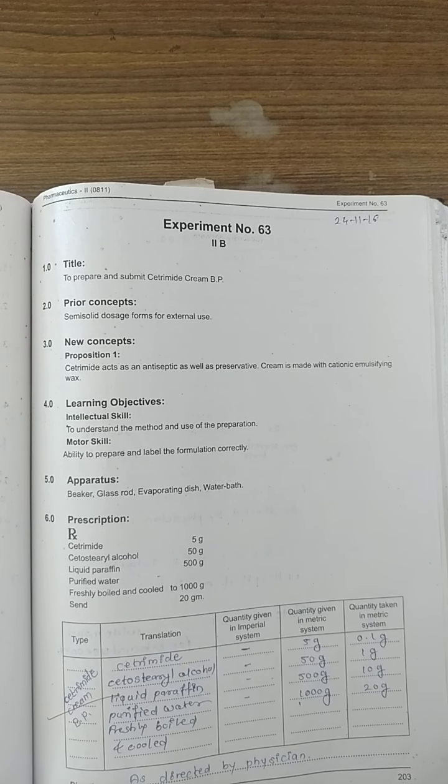We have to make cetrimide cream as per the given prescription. The ingredients are: cetrimide 5 grams, cetostearyl alcohol 50 grams, liquid paraffin 500 grams, and purified water freshly boiled and cooled up to 1000 grams. This makes 1 liter, which is 1000 grams, meaning 1 kg of cream.